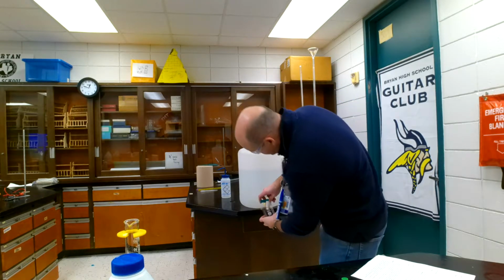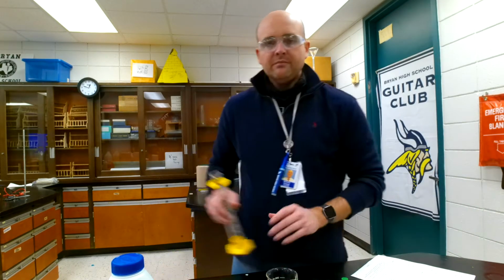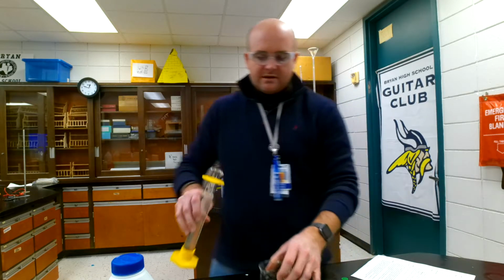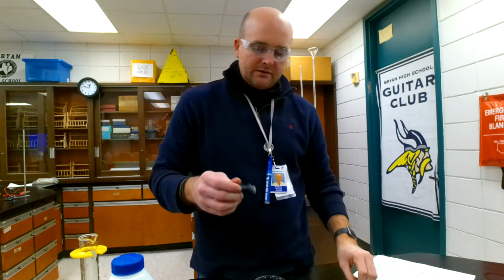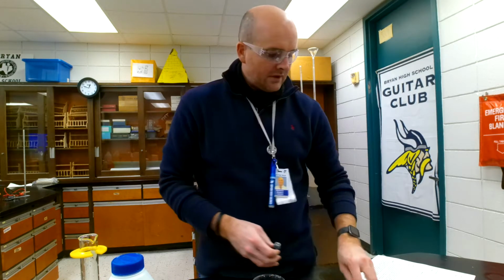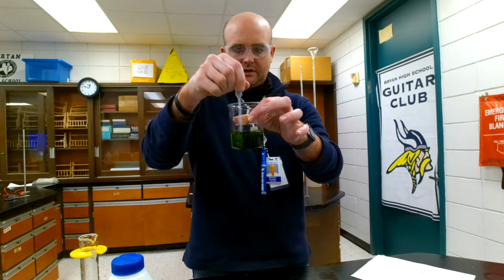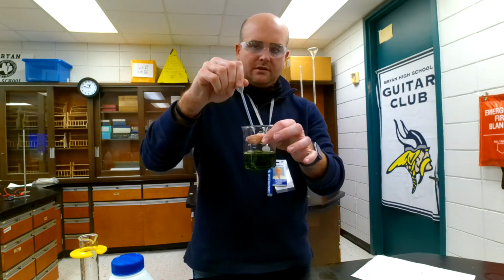So here we go. Let me use my graduated cylinder. And so there is 90 milliliters of water. And then we'll take 1 drop of green food coloring. This is the gel food coloring, so it is going to be really thick. And we'll go ahead and stir it up, and you'll see that it's very, very green. Gotta get all that gel dissolved. And there we go.